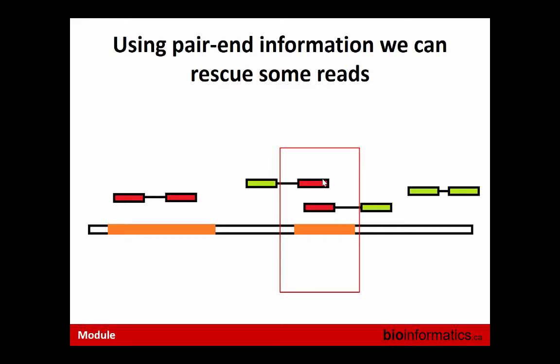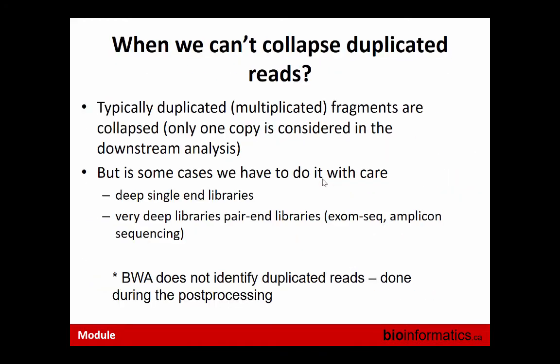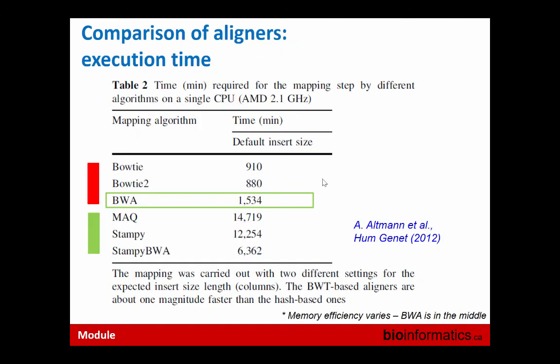Yes. In the table that you showed us for the different aligners, it seemed like the Bowtie tool had less time and higher sensitivity and specificity. So why BWA? It's for us at GSC. I'm working at the Vancouver GSC. It's more historical. BWA was developed earlier, when the other aligner was Bowtie. The running time was much higher, and I think the error rate was more error prone. BWA was more stable.